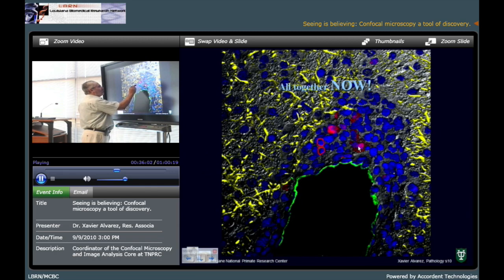The influx of cells into this particular cuff is mainly monocytes and T cells, which can be T8 or T4. Those will have a smaller nuclei like that, but the big ones are most likely monocytes. We could stain for the different lineages and the different kinds of macrophages.